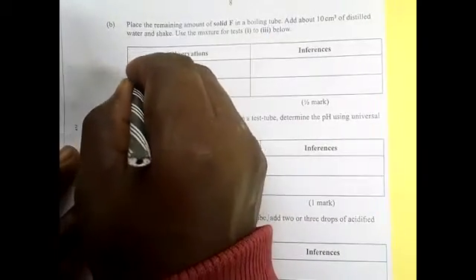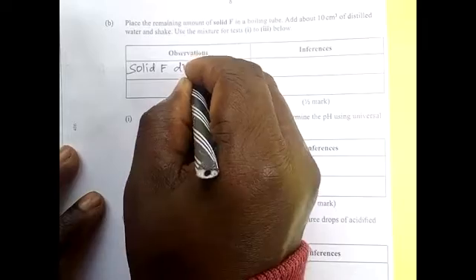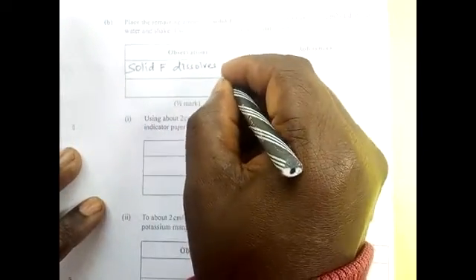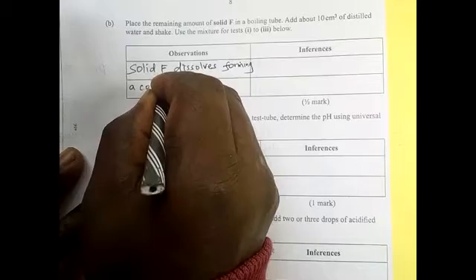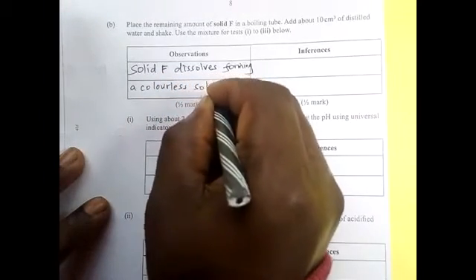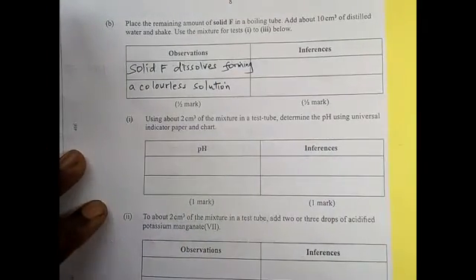So solid F dissolves, forming a colorless solution.